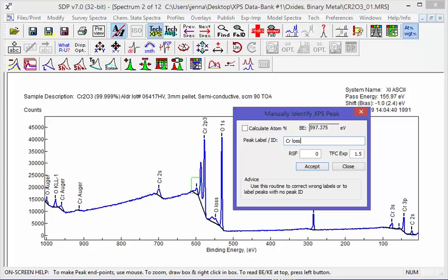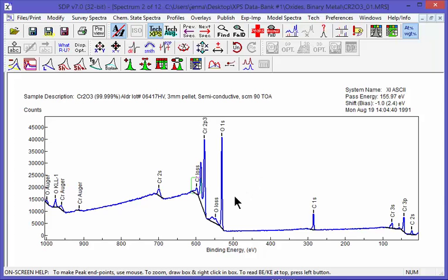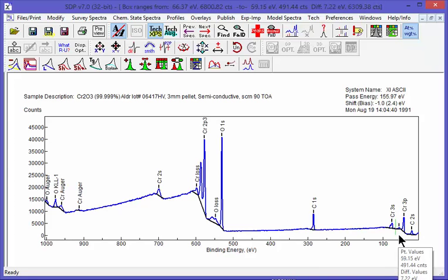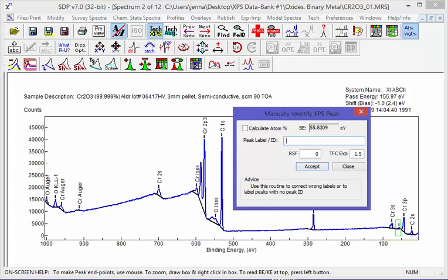Chromium loss peaks, and loss peaks in general, I should say, are about 10 to 15 eV above the main XPS signal. So that's why you see an oxygen loss peak here. Here's another loss peak. This is from the chromium 3p. So to help the customers or to help the people seeing the data, let's go ahead and add a label for what that is. Cr LOSS, a chromium loss peak.